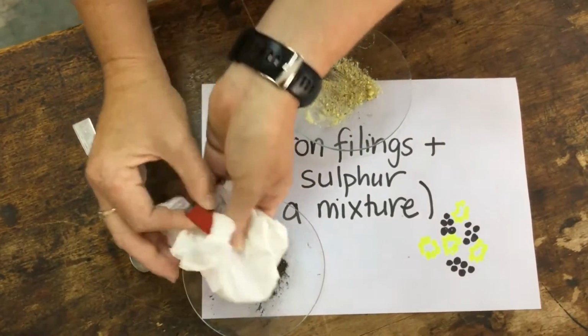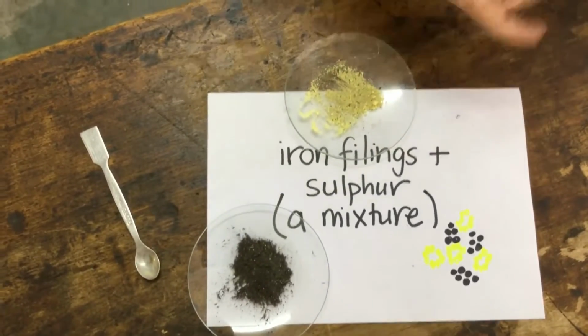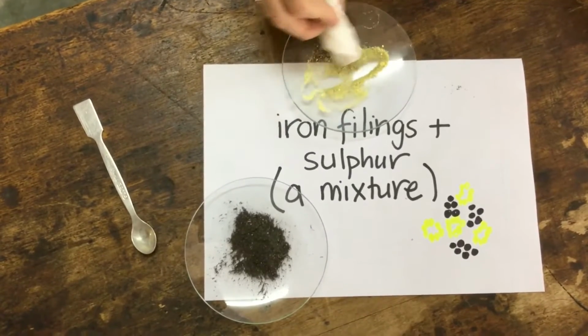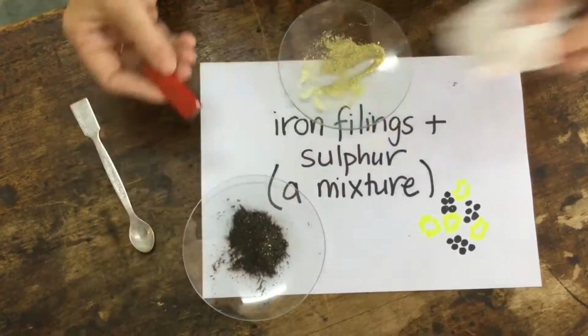And I can keep going and sift this out and remove some of the yellow sulfur. Eventually, you can see it's a little bit dirty from some of the impurities in the iron, but eventually I can remove most of the iron filings and I can separate these two substances.